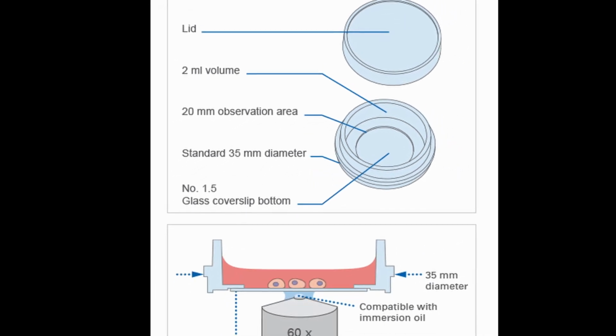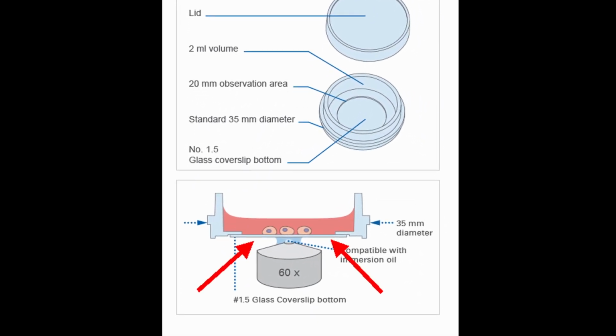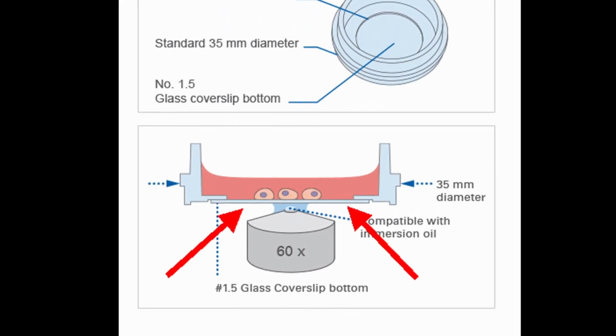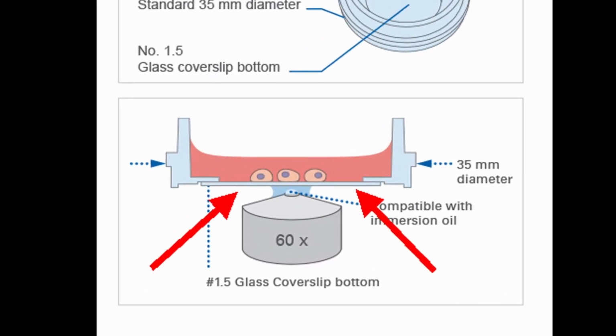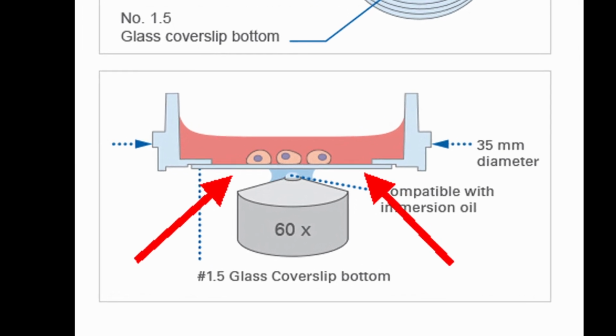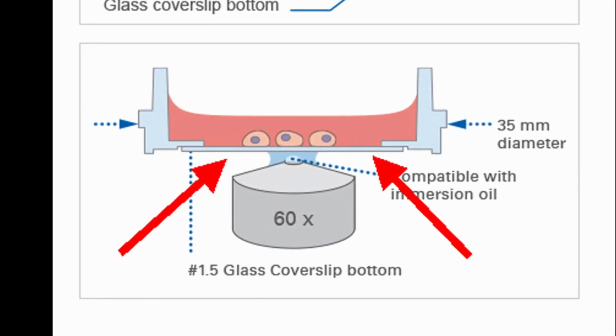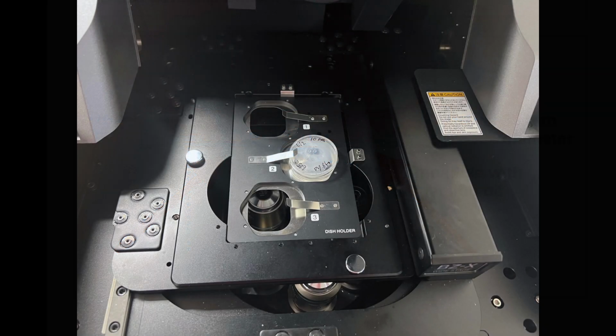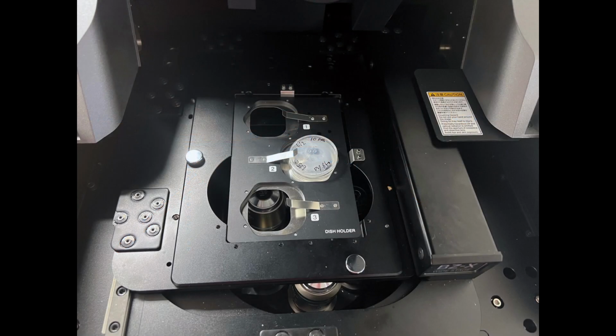And you like to do this under oil objectives, so that those are oil immersions. So this allows you to actually examine fluorescently live cells while they're being cultured. So we were kind of experimenting with that. There's a special attachment on the confocal that actually attaches the culture dish to the microscope.